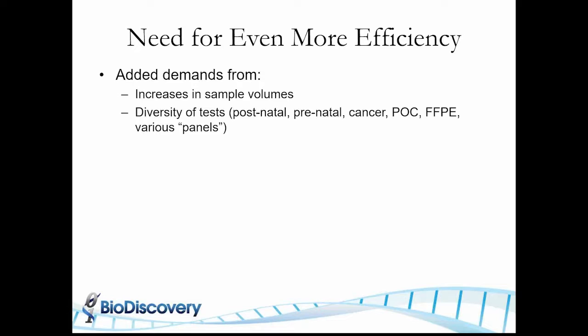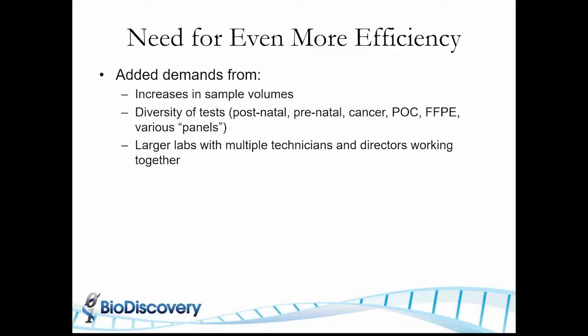So in addition to postnatals, there's prenatals, various cancer cases, POCs, FFPE, panels, etc. So that is growing. And in addition to the growing volumes and types of tests, the labs have multiple personnel, like technicians and directors, doing different tasks. So how do you organize and make people work more efficiently together?